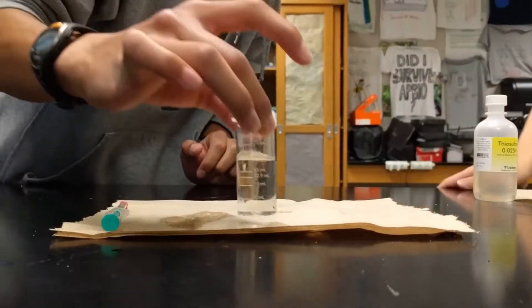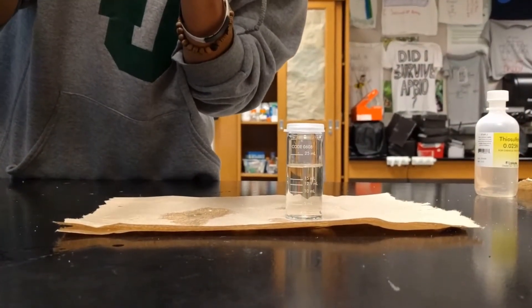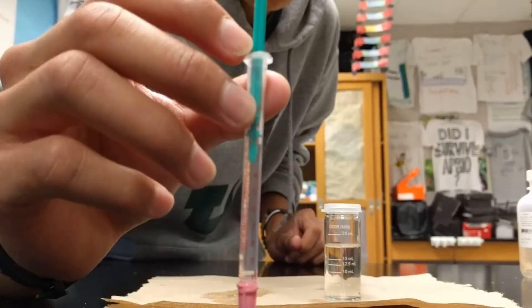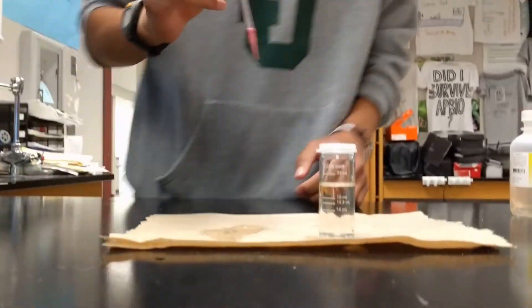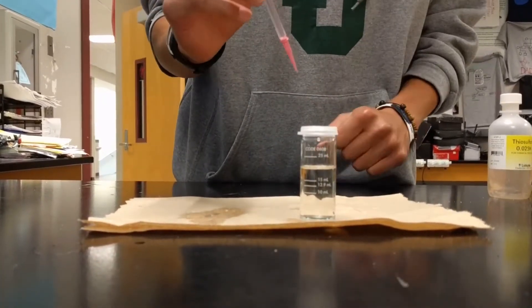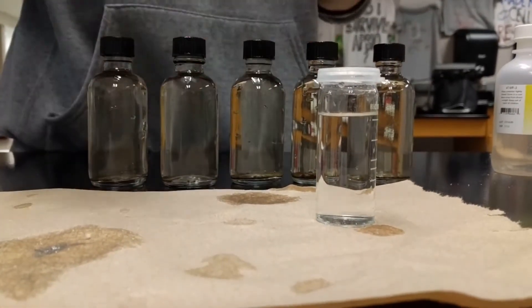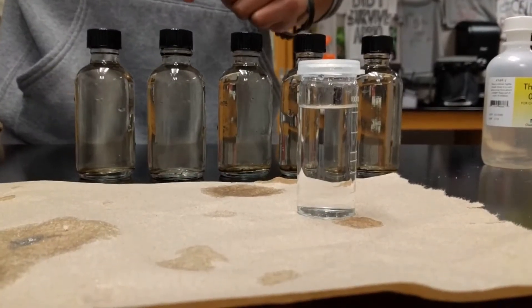So we have a clear solution now, and on our pipette it reads 2.25, and that is the value that corresponds to the dissolved oxygen level in the sample. We will be using this to measure the dissolved oxygen of all of the samples after we have left them to sit overnight with the specific treatment.